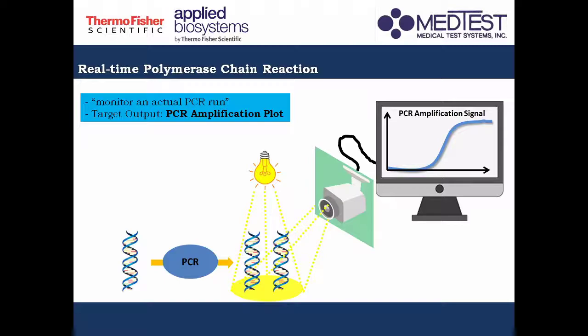So kumbaga, meron tayong PCR process na nangyayari, then at the same time, meron tayong camera na nagde-detect doon sa process na yon, so that we would be able to know how the PCR is going.